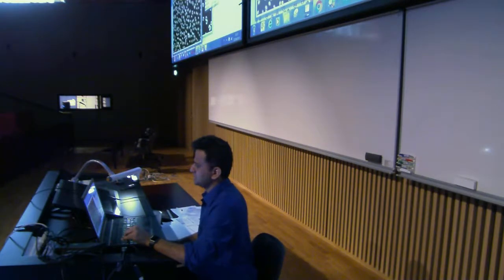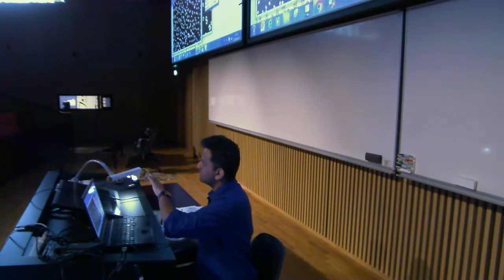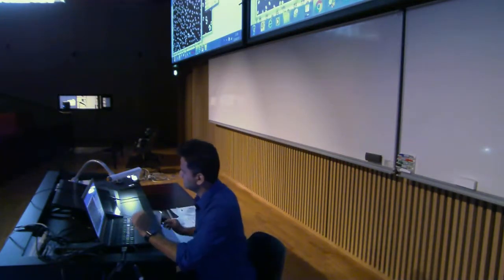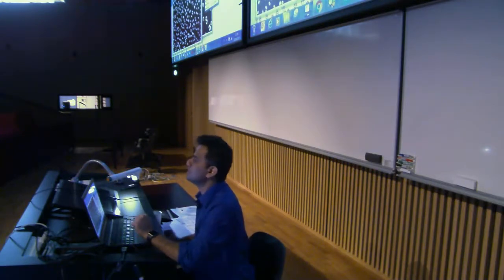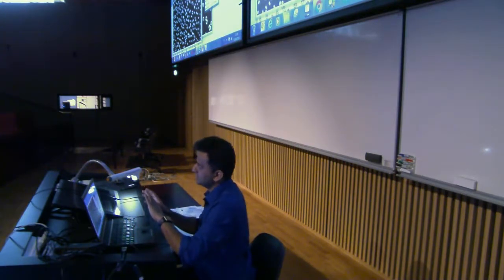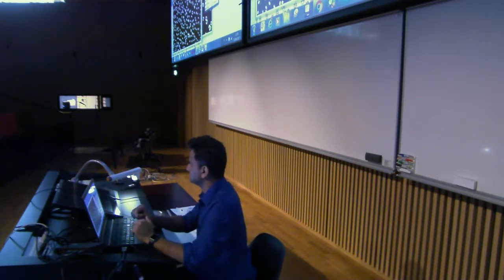So I can switch on, switch off different ROIs. Maybe I'm interested actually in applying this ROI on different channels. That is also possible. You just select a particular image and just hit this button and say show all. Your ROI will be displayed and transformed to the other image as long as they have the same physical dimension. This is useful when you do multiple segmentation. Let's say I segmented cytoplasm, I segmented nuclei, and then I segmented the entire cell. So there are basically three overlays or three masks, and you want to simultaneously put those three masks onto the raw data, then that is possible using this.